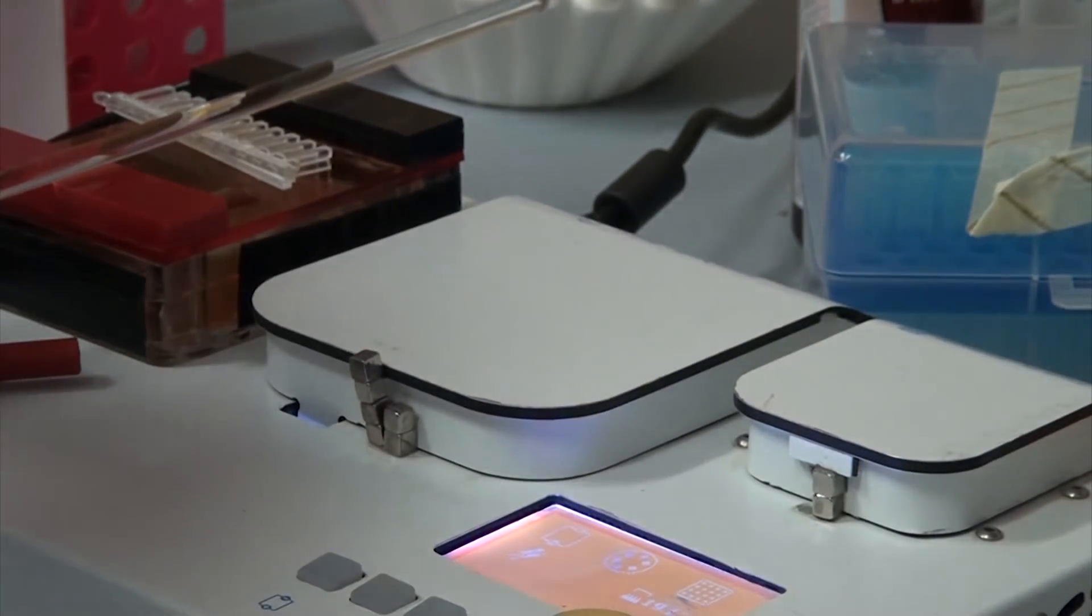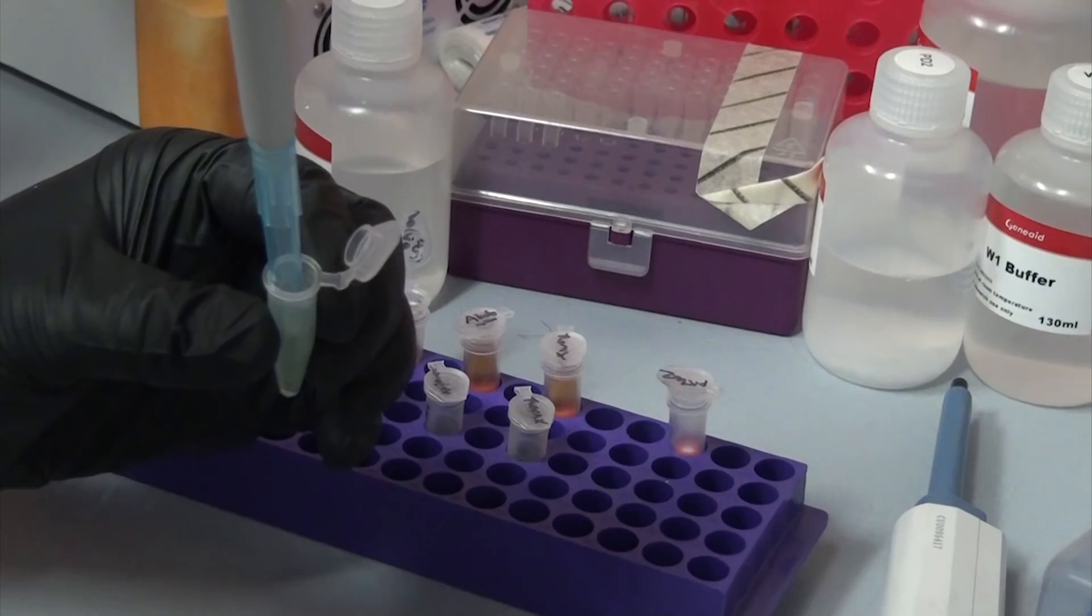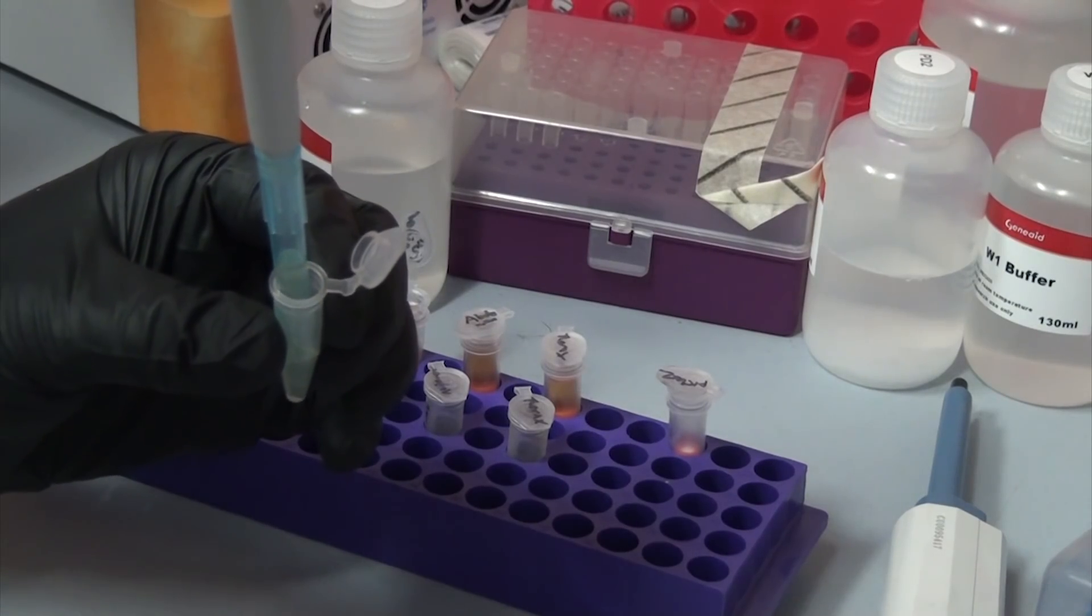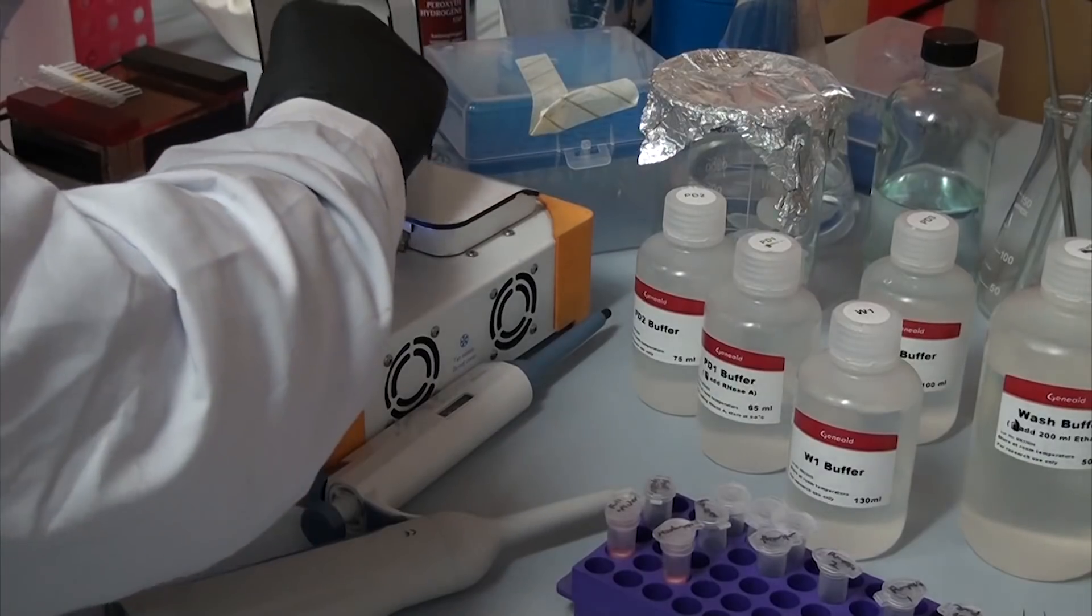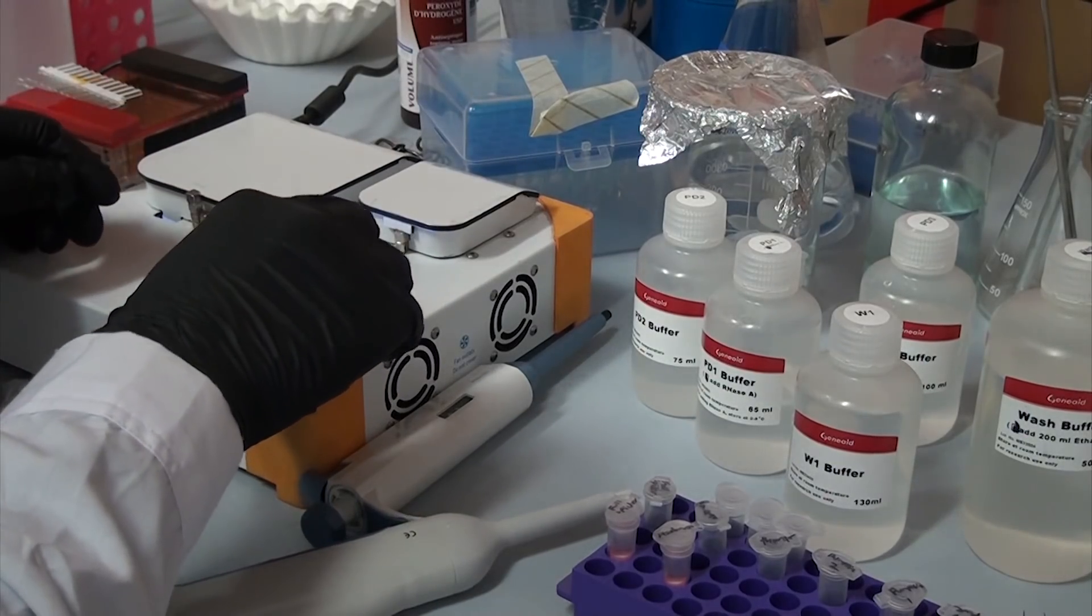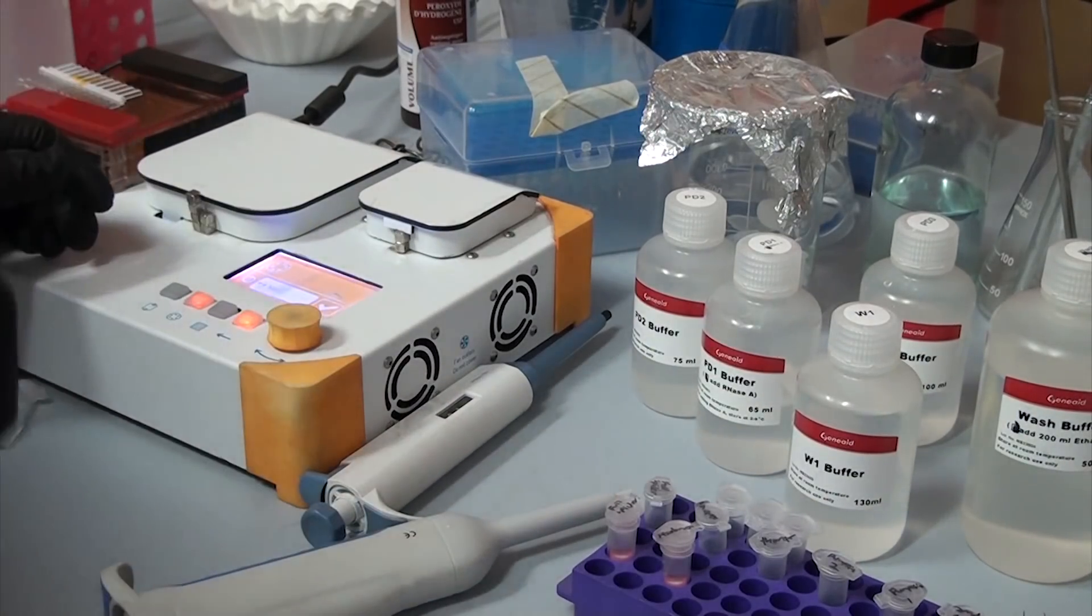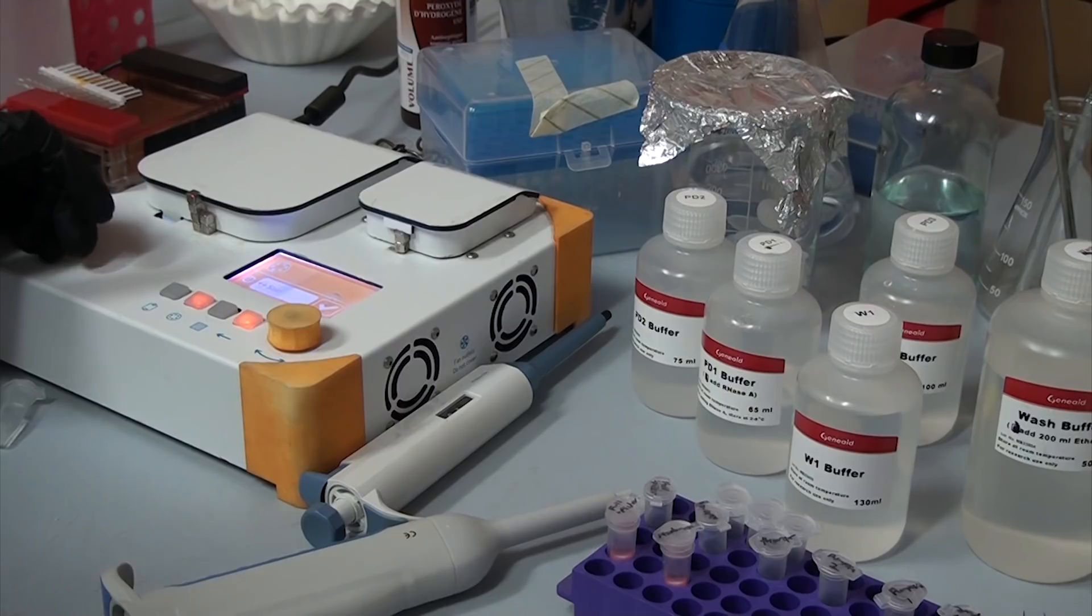On the day of the extraction, I first spun down this liquid to collect all the bacteria into a little pellet at the bottom. The LB was removed, and then it was onto the various buffers and solutions in the kit. The kit just labels things like PD-1, PD-2, and W1, which doesn't really tell you what's going on, but I was able to find some more info online.